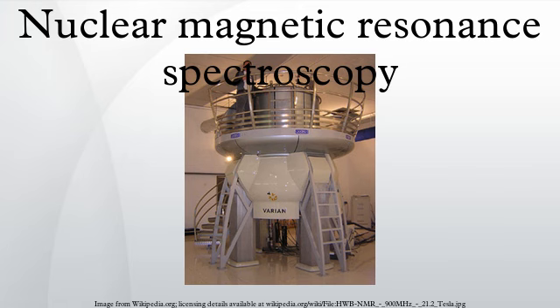History: the Purcell Group at Harvard University and the Bloch Group at Stanford University independently developed NMR spectroscopy in the late 1940s and early 1950s. Dr. Edward Mills Purcell and Dr. Felix Bloch shared the 1952 Nobel Prize in Physics for their discoveries.